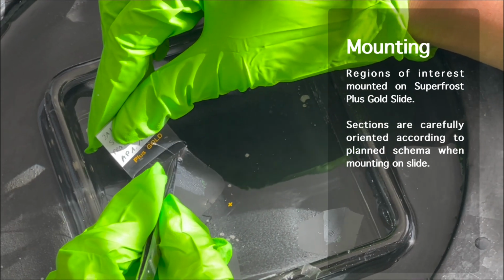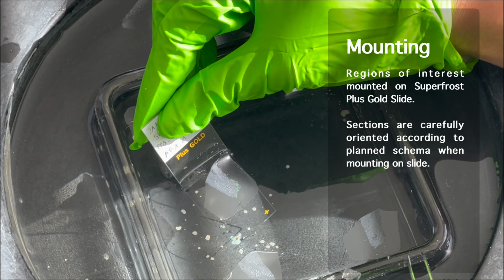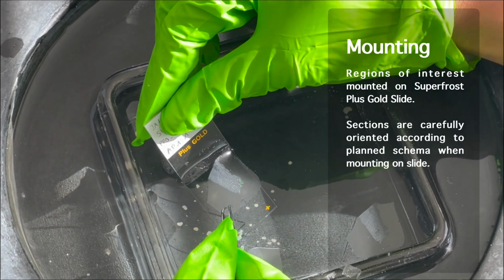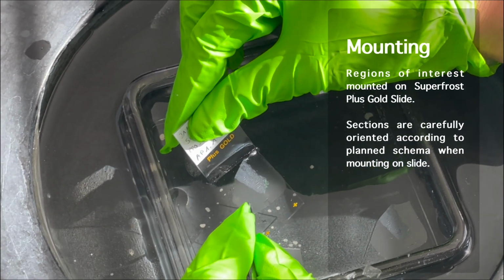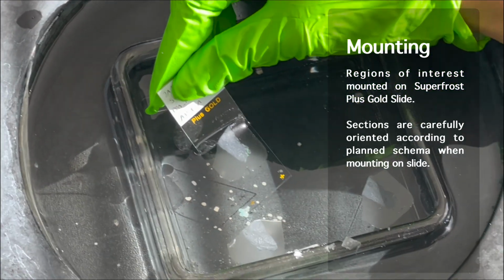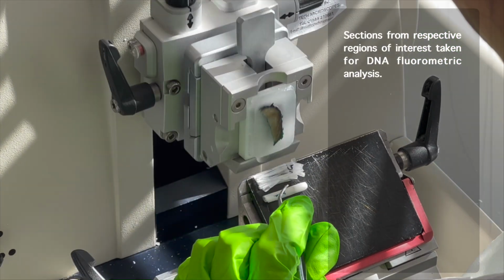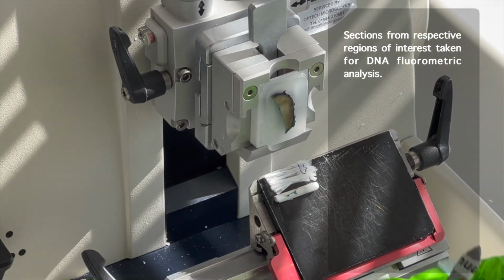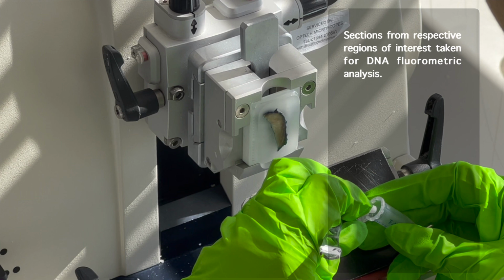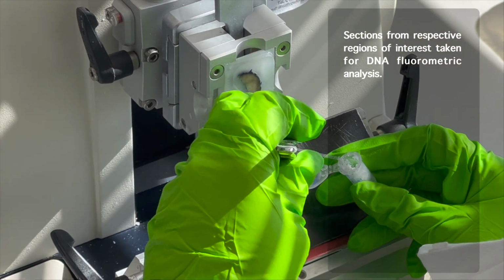The sections are carefully mounted on a Superfrost Plus Gold slide. It is important to ensure the section is carefully oriented in the middle of the slide, with the tissue oriented according to the planned schema. Shavings from respective regions of interest are also taken and placed in an Eppendorf tube for DNA fluorometric analysis. This is part of our quality assurance steps.